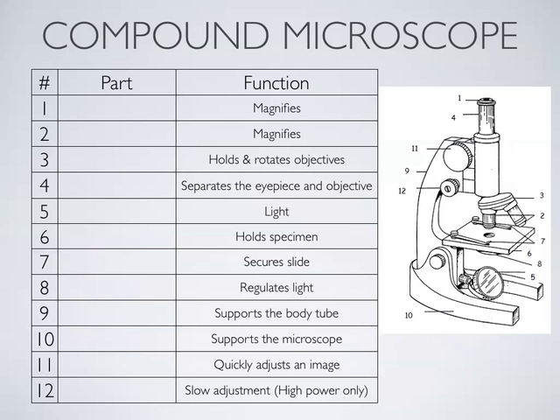All right. So to begin, there are two lenses on this microscope that magnify what you're looking at. There's the lens up here in the eyepiece. Okay, that's one. And then there are these lenses down here. You could rotate these lenses to choose one of the three powers. These lenses down here are called the objective lenses. We have low, medium, and high power objective lenses on these microscopes. Low is red, medium is yellow, there's a stripe on it, and blue is high power. And each one magnifies a different amount.